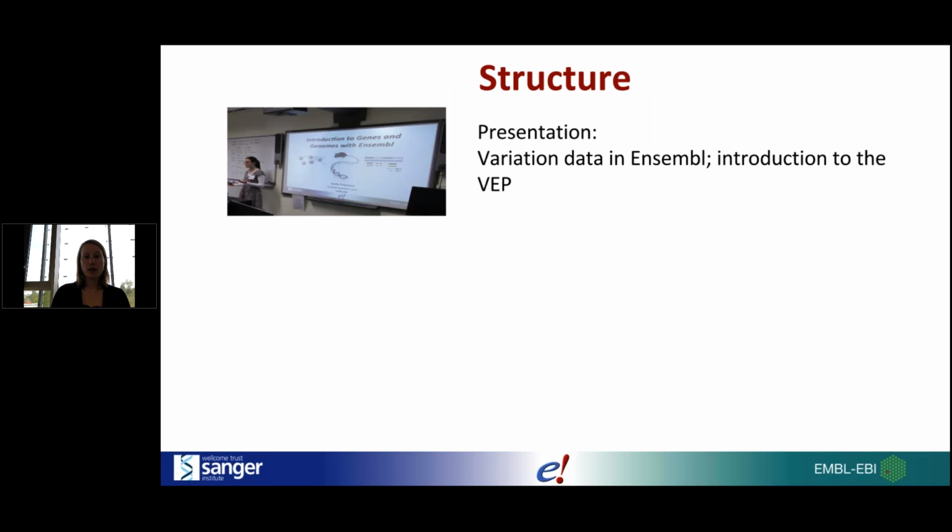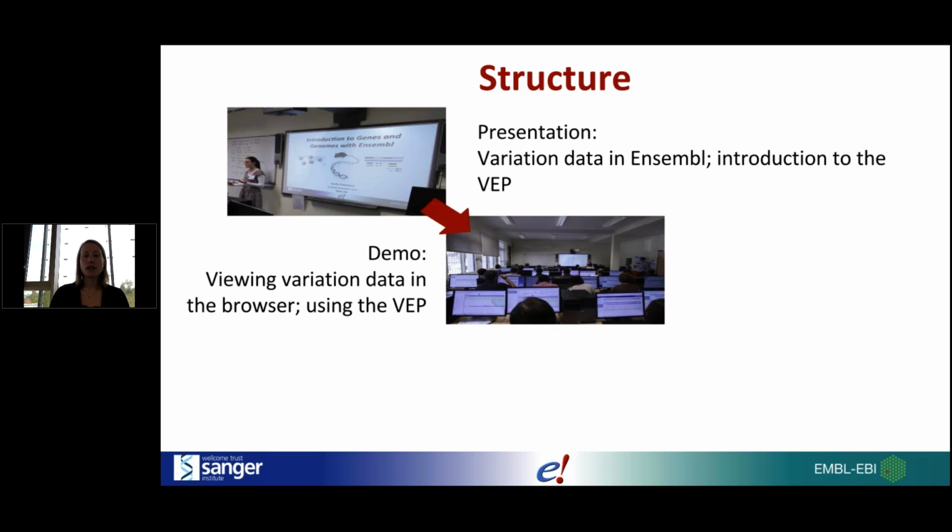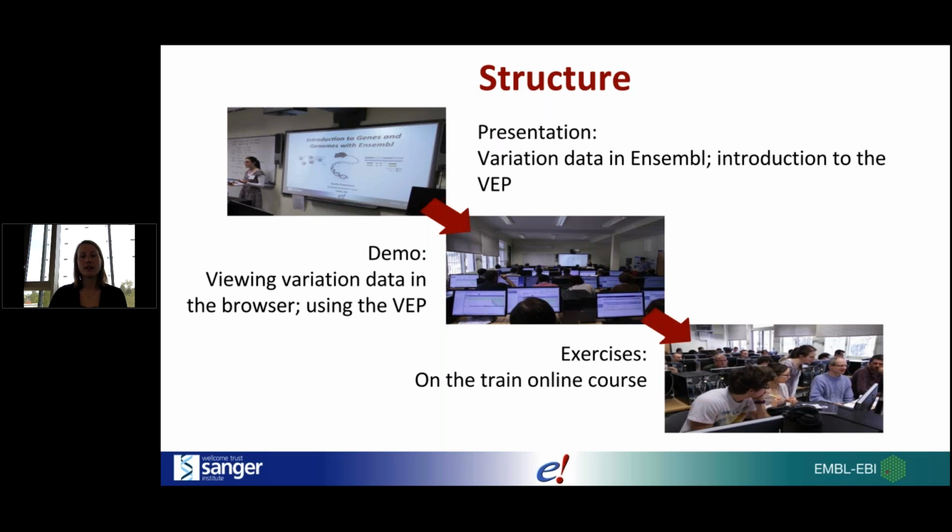So today, I'll begin with a presentation on variation data. And then I'll have a live demo on the website to show you how variation data appear in the browser. And then I'll go back to my presentation and I'll introduce the VEP tool to you. And then we'll have another demo which will focus around using the VEP in the browser. Lastly, there are some exercises available to you, and I'll show you in a second where you can find them.